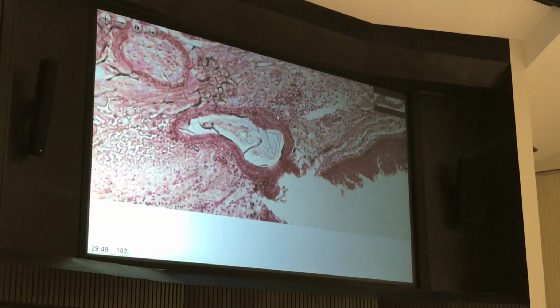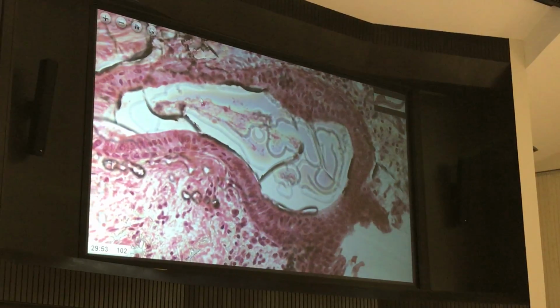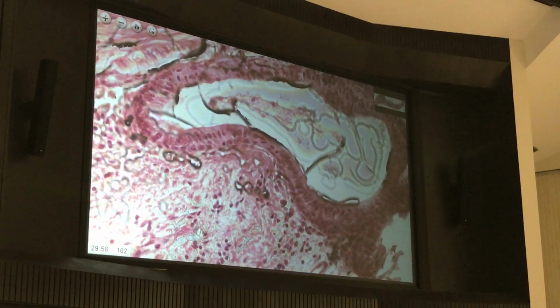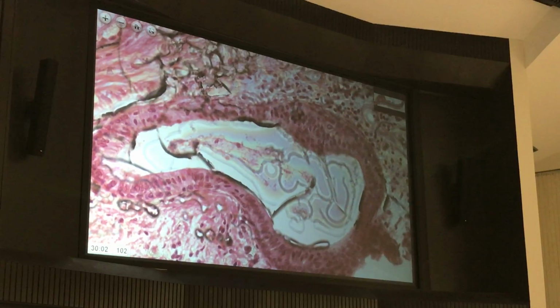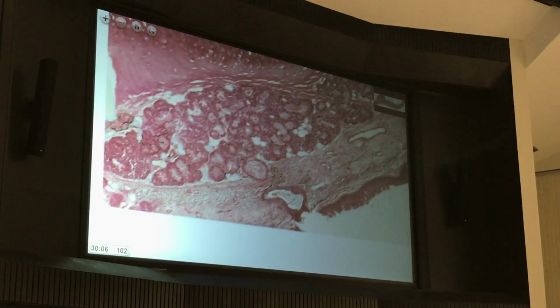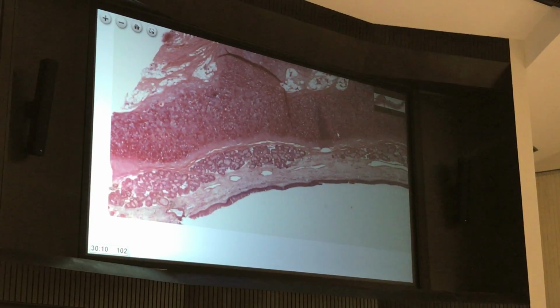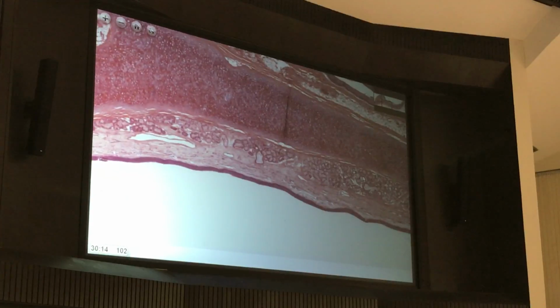Oh, there's a piece of one. Slice, but this would be a stratified columnar. I'll find a nicer one for us. Let's see. Did we look all the way around? That's where we started.